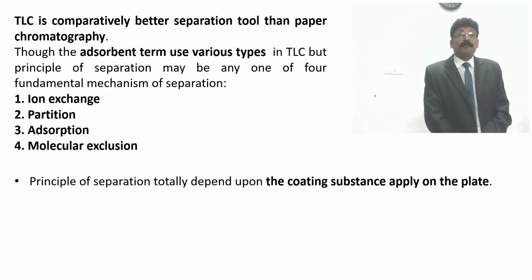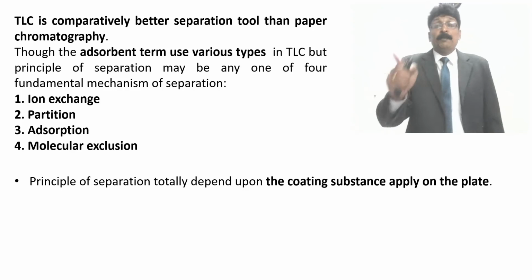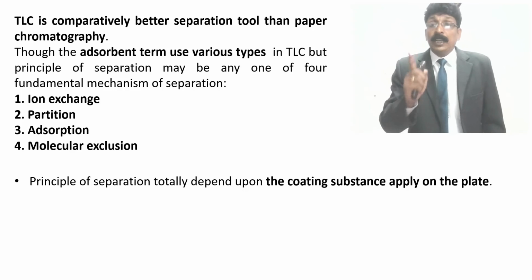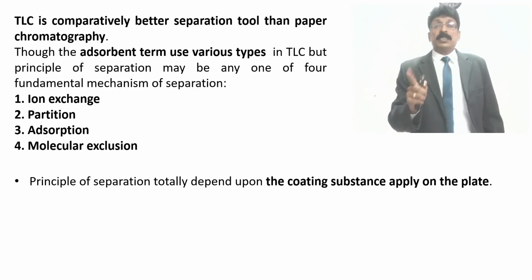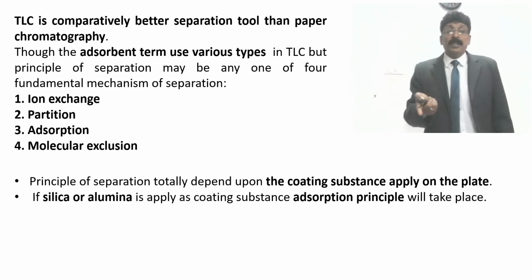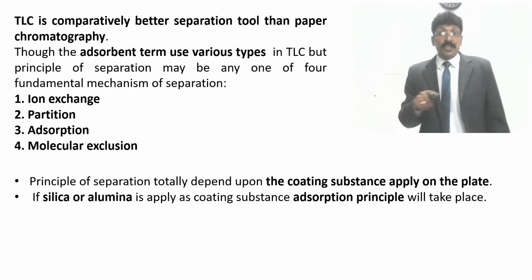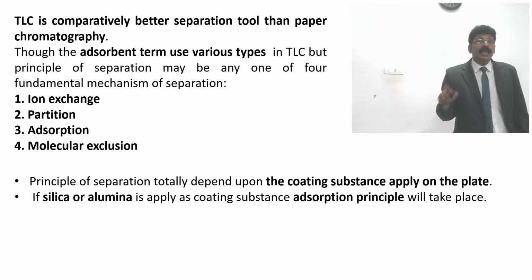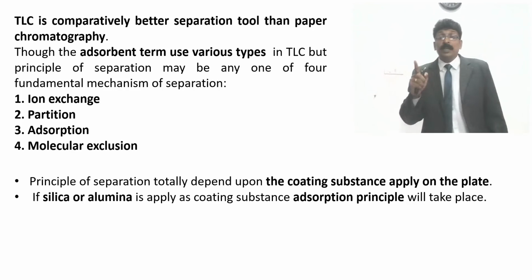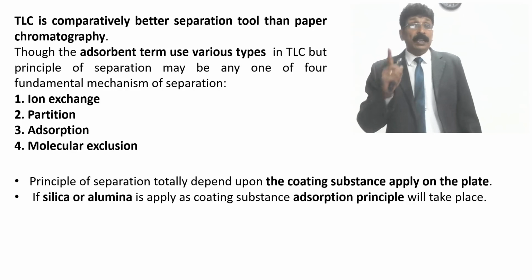The principle of separation totally depends upon the coating substance made on the plate. From the beginning I was telling you, understand? If you are using silica or alumina as the thin layer coating substance, the adsorbent works on the adsorption principle. It is a solid. So we should remember what type of adsorbent you are using.